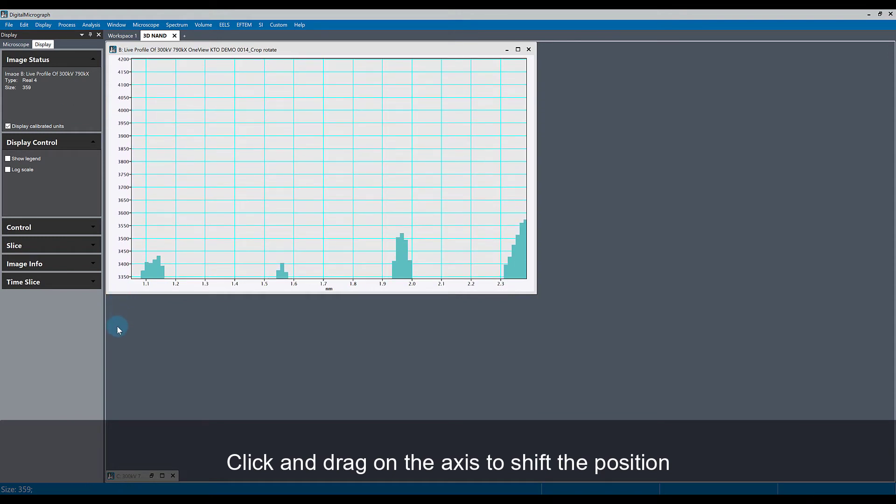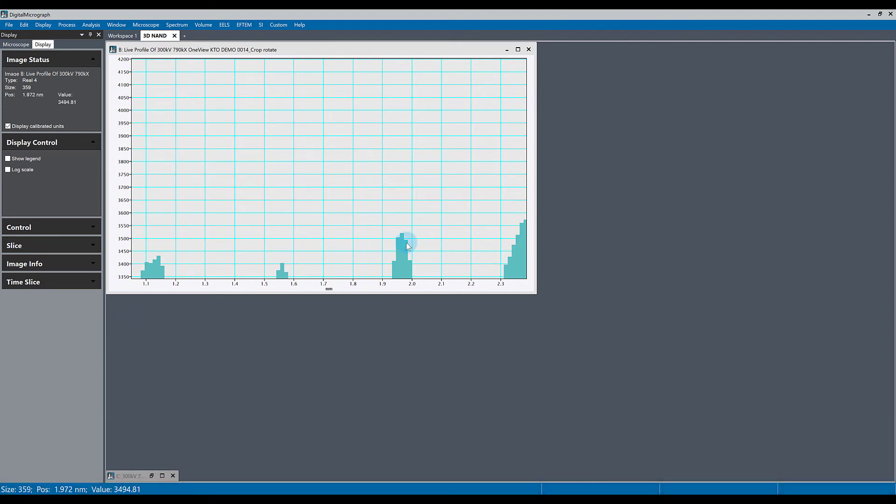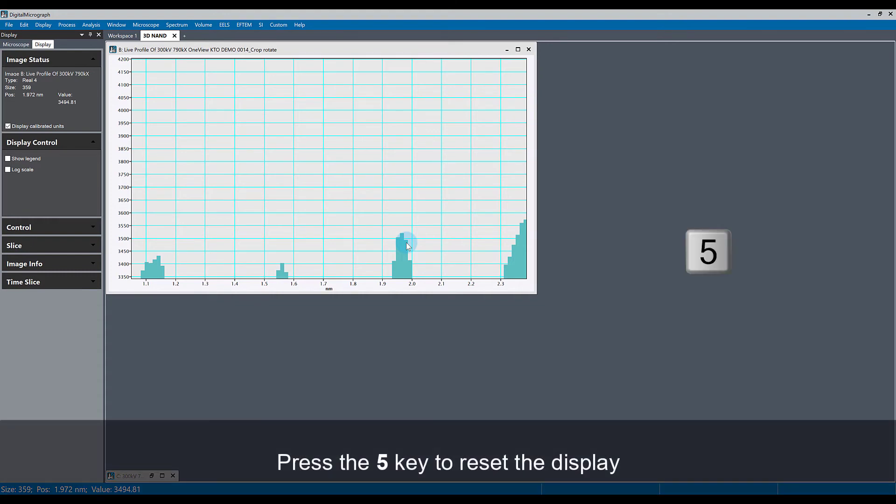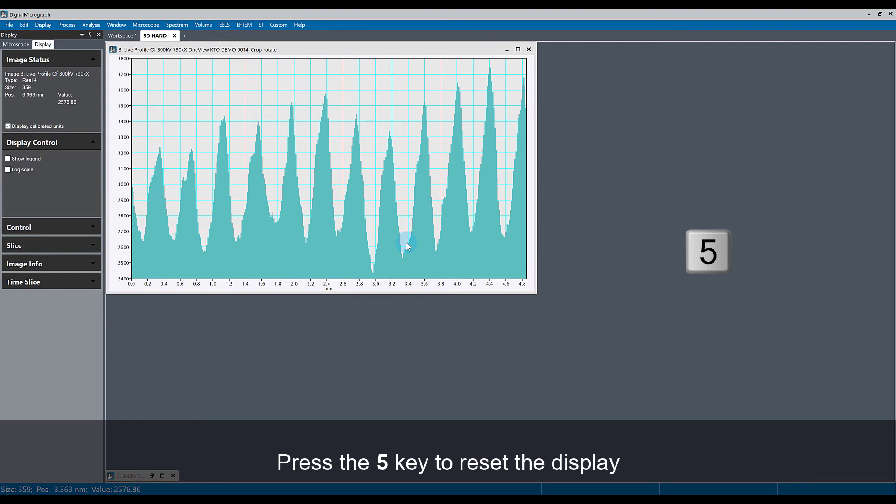For example, we've adjusted the line profile to a manner which we don't like and we want to go back to what it looked like before we did anything to it. If we hit the 5 key, it very quickly homes the display and shows you what the line profile was before you started zooming in or out on your axes.